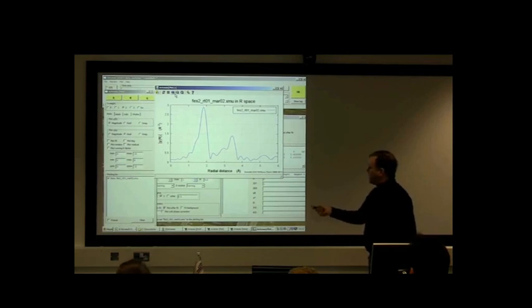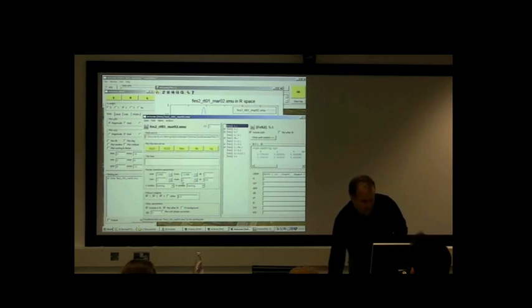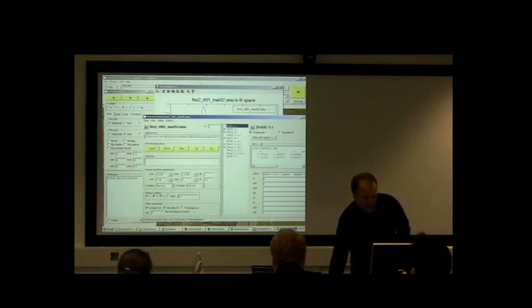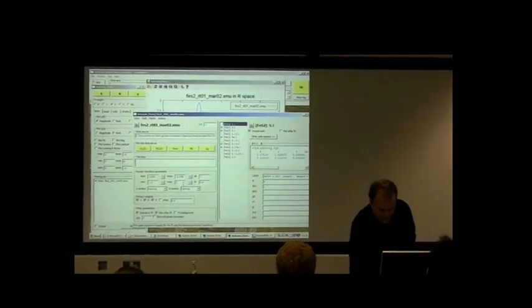So the way we do that is, we'll say start the fit about there. That's 1.3. So R min will be 1.3. And we'll do R max at this cusp down here, which is at about 2.3. So here we'll say 2.3.